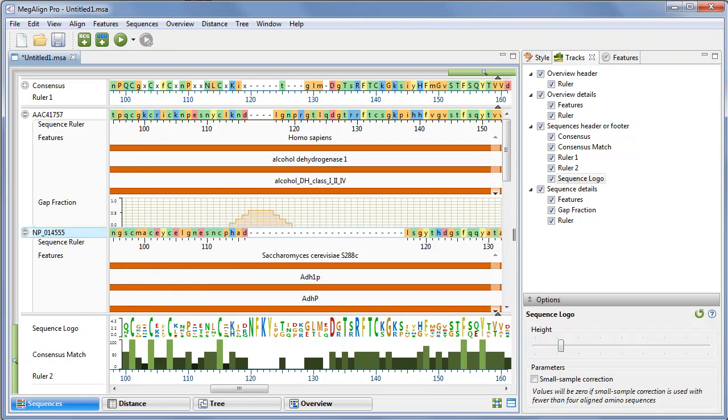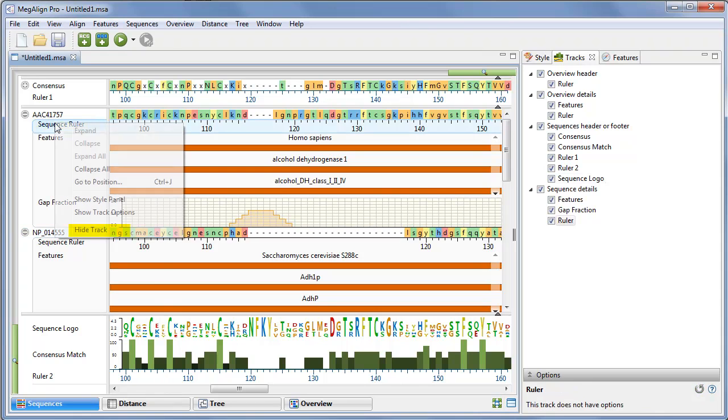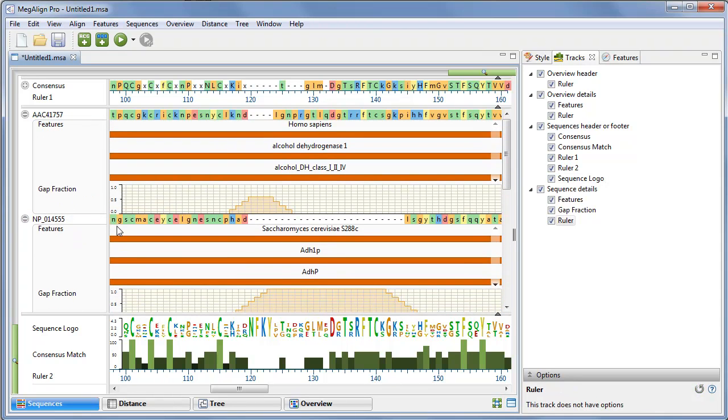To hide a particular track type for all the sequences in the view, right-click on it and choose Hide Track. Note that doing this removes the check mark from the Tracks panel.